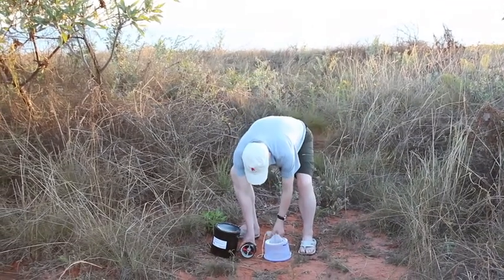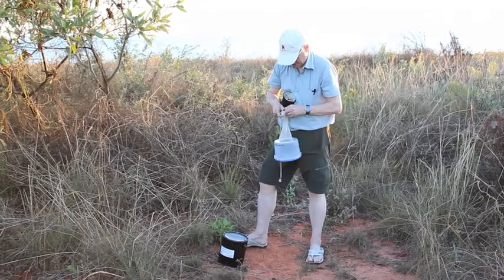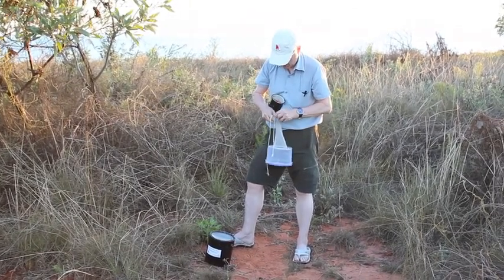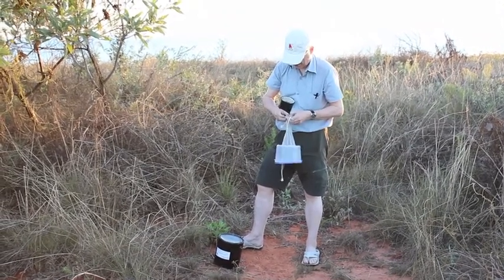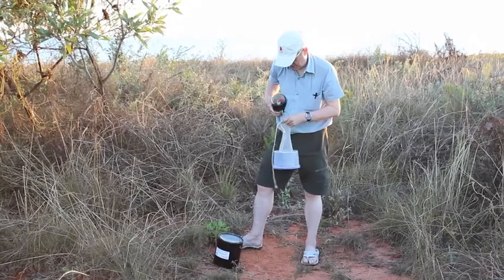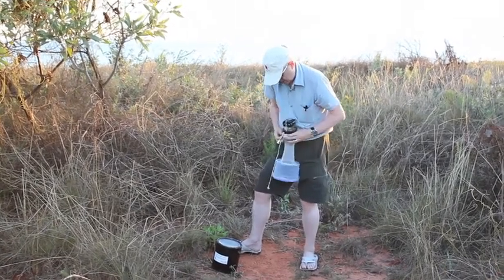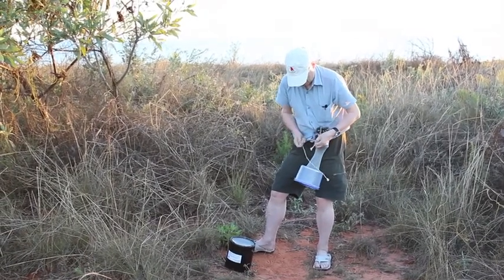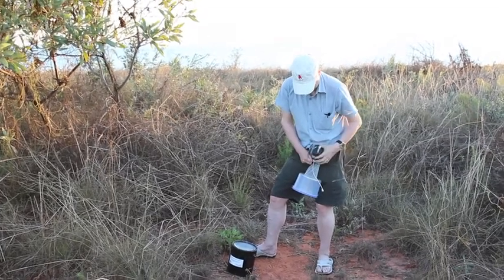First we'll assemble the trap, and this is what we're going to catch our mosquitoes in. This sock-like attachment secures it to the motor, and the motor drives a little fan.